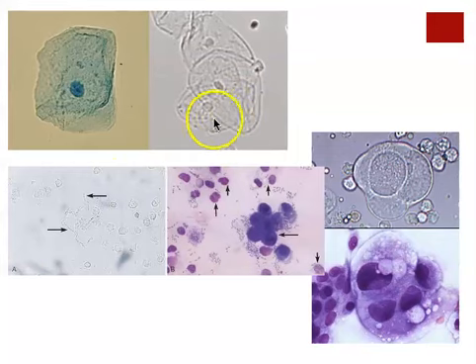Over here we have 1, 2, 3, maybe 4 epithelial cells, but of course they look quite different than the cell on this side of the image. This cell has been stained. You can see that it's taken up this sort of blue color, particularly in the area of the nucleus. Over here, these cells have not been stained. And I think you can see that you just get more detail when you stain a cell.